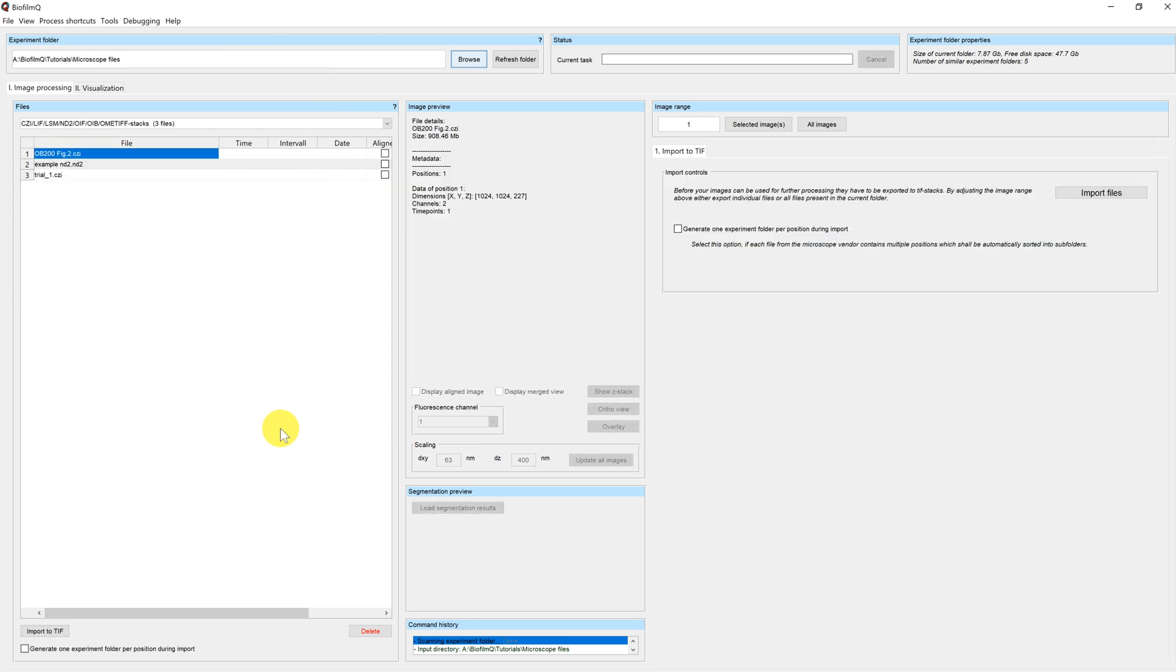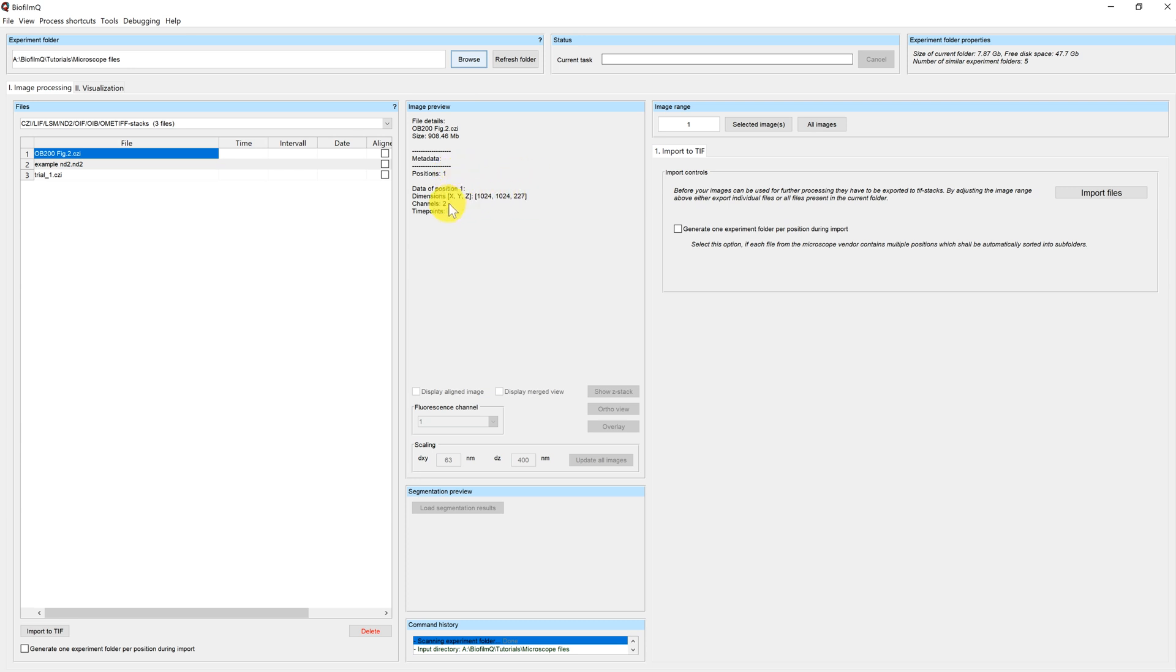You can see that all three files appear in the file list here. You can also see that in the image preview, there is no longer an image, but instead information is being shown. In this case, you can see how many positions you have in your file, what the dimensions of your images are, and how many channels and time points you have.